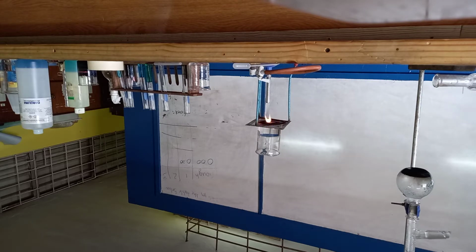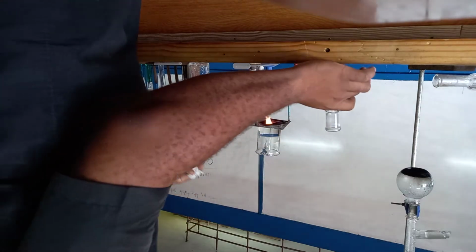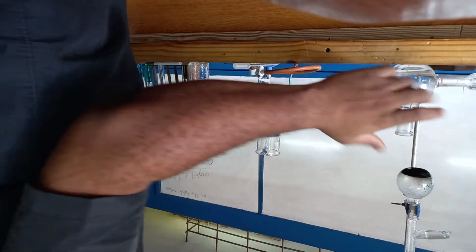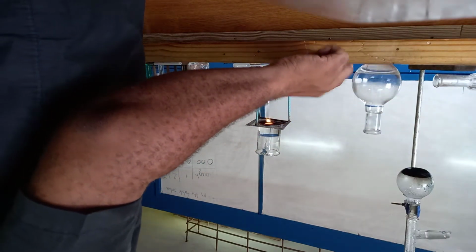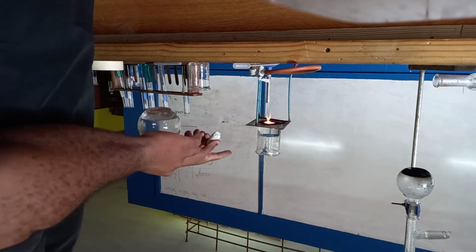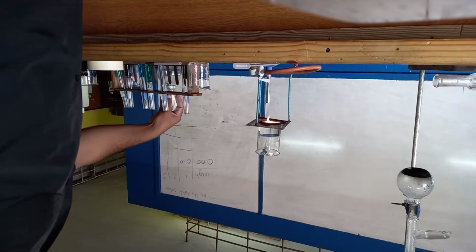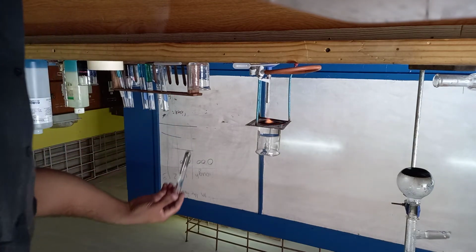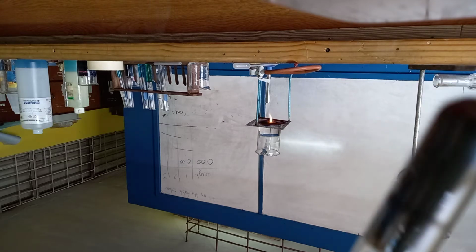Alright, welcome back again. So here I took off the aldehyde. Alright, so this is our product. So I have my hot water bath here. So before I started the video, I did the test initially, and this one is the silver mirror test.